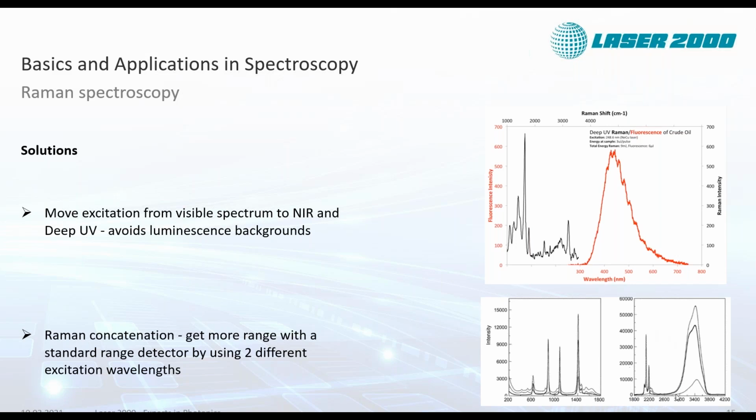So now you have the second half of the spectrum, and you can see the stretch bands and the water bands, and this with only one spectrometer. The only requirement is that you need proper optics to support both wavelengths, and spectrometer software where you can set the excitation wavelength accordingly, so that it directly shifts the wave number scale to your two excitation wavelengths.